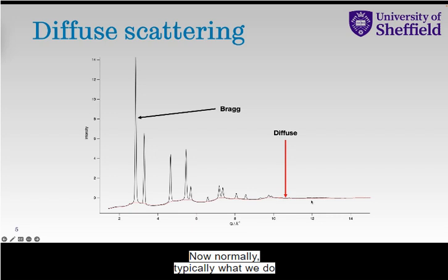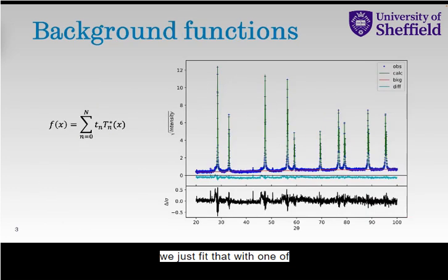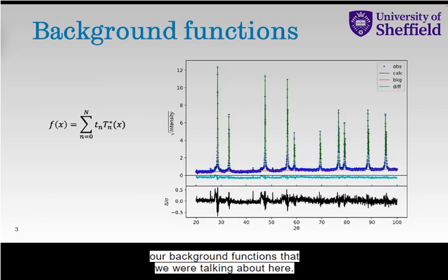Now, typically, what we do with most diffraction patterns is we just fit that with one of our background functions that we were talking about here, something like a shifted Chebyshev polynomial. However, sometimes that might be what we're interested in, and that opens up a whole new separate area of study that is far beyond the scope of this course.